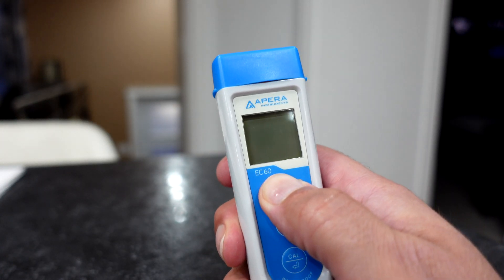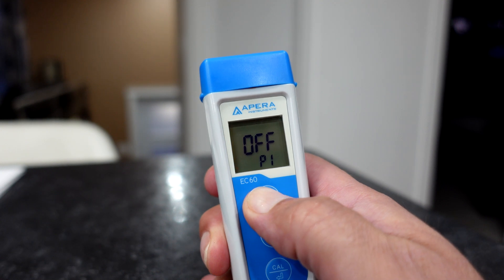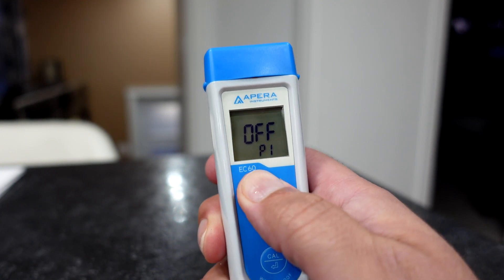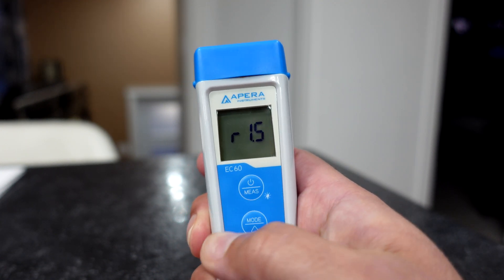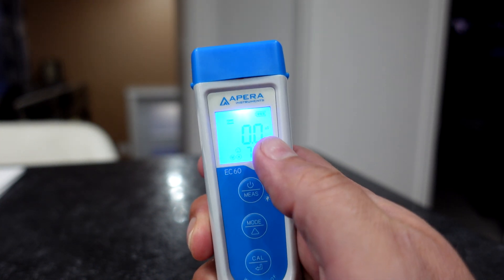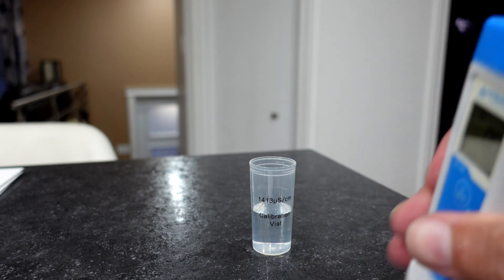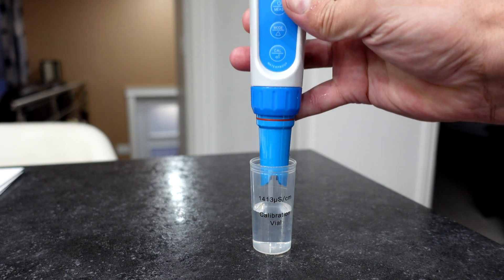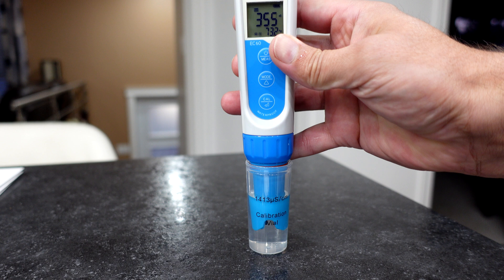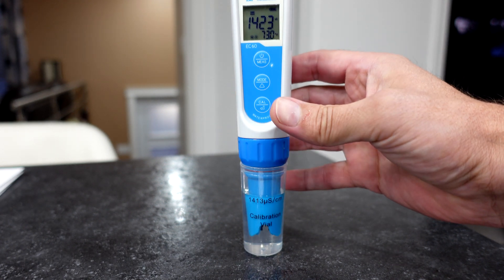According to the instructions, we just have to turn this thing on and put it to US. I'll shake off the probe because I did have it in water, then we will read. And it should be 1413.